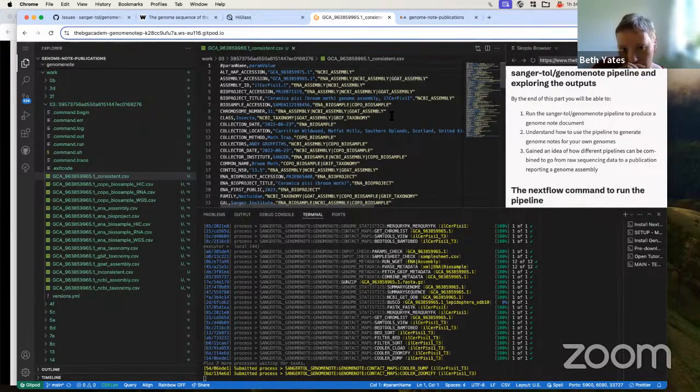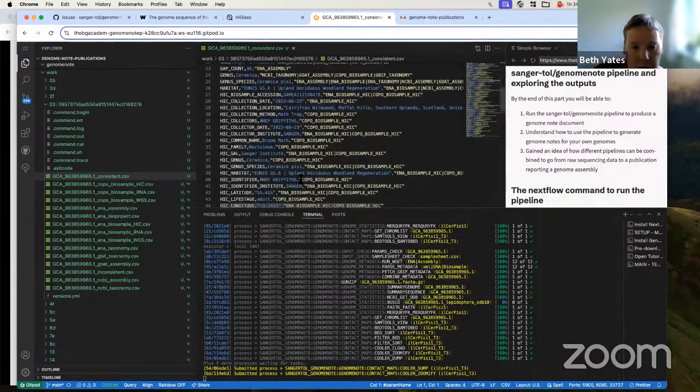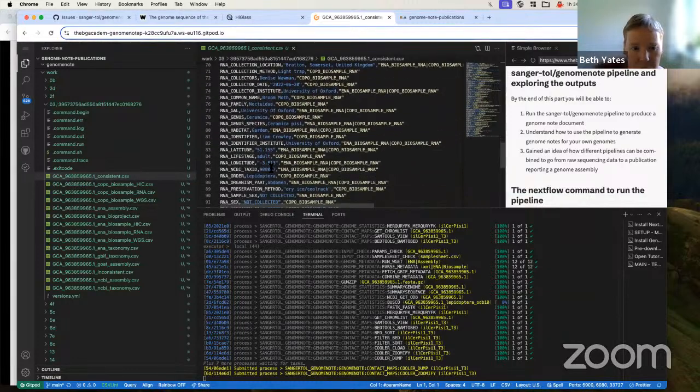This isn't information that makes its way through to the template, but it's information that you, as a pipeline runner, can go away and check. This lets you see where the data has come from, what the values are, and how much support it has across different sources, and what's actually possible. This is all information that will then be put into the template.